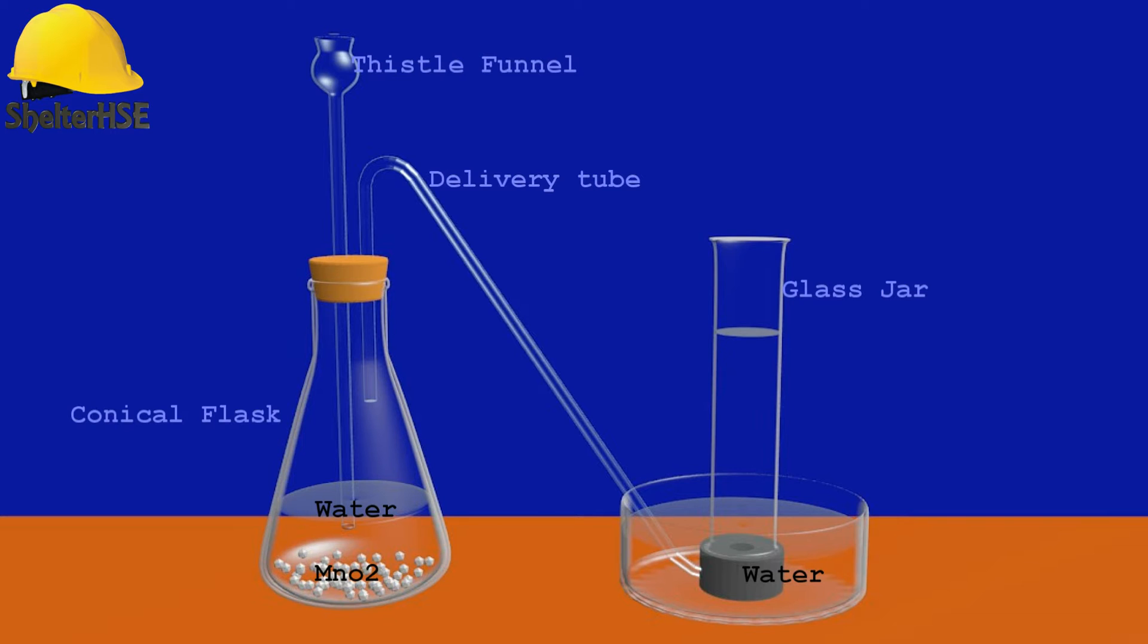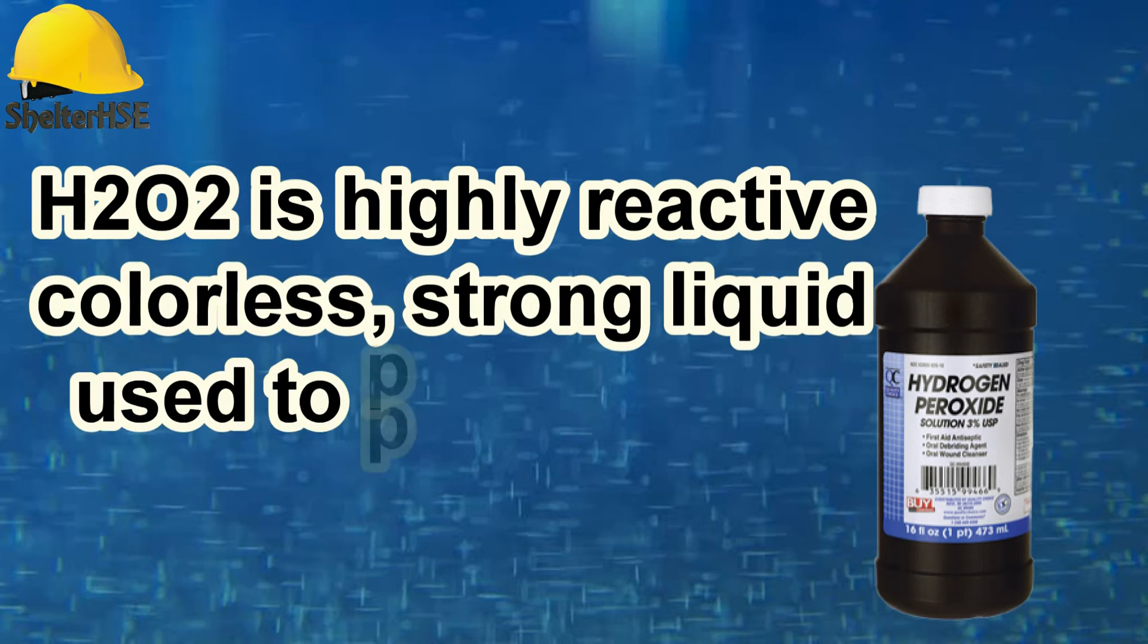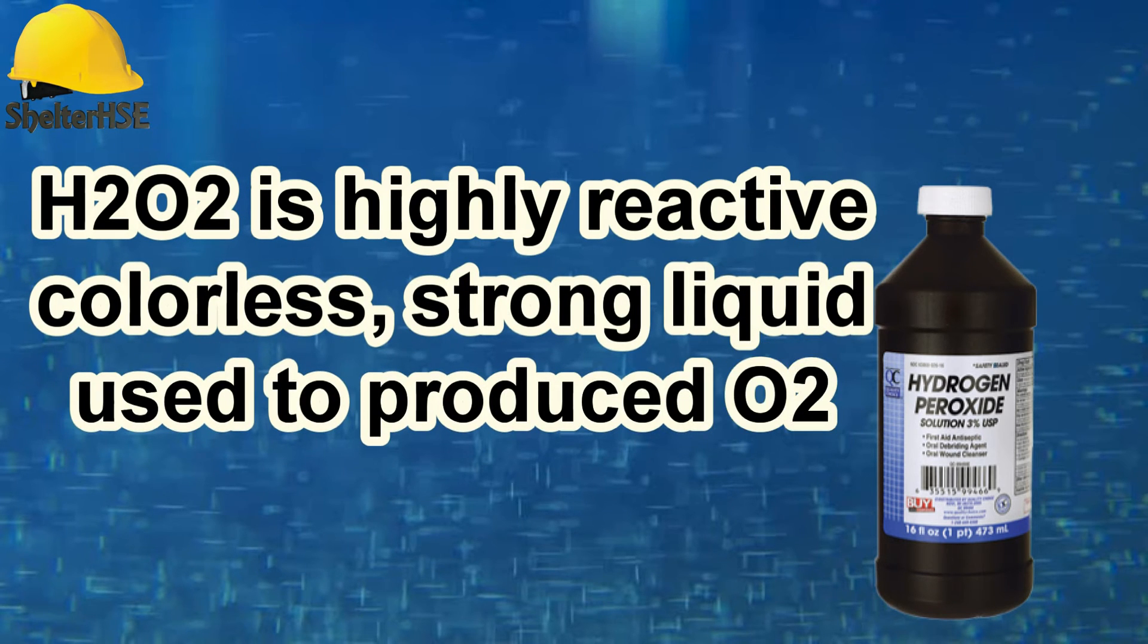is ready, pour hydrogen peroxide slowly via thistle funnel. Hydrogen peroxide is a colorless, strong, heavy oxidizing liquid with the chemical formula H2O2. It is highly unstable and used to produce oxygen gas in laboratory.